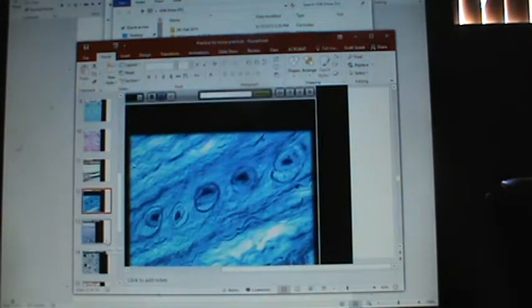Here's another kind, and you can see. Look at these things. What do you think? Kind of tough. Major tissue type? Connective? What would be the specific type? This would be fibrocartilage. And you can see the chondrocytes, look like little eyes or pomegranate seeds, and then a lot of this tissue going through here, making it very, very strong. All right, so that would be fibrocartilage. Okay, and let's look at another one.